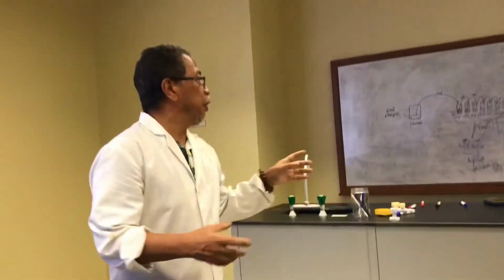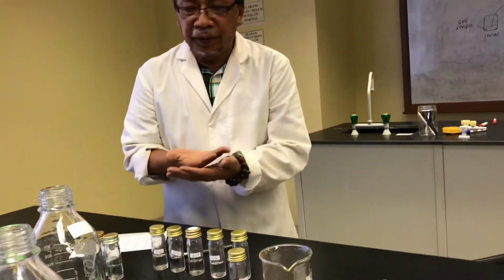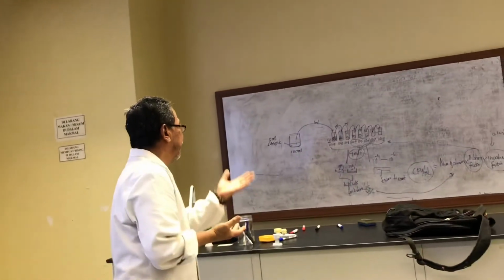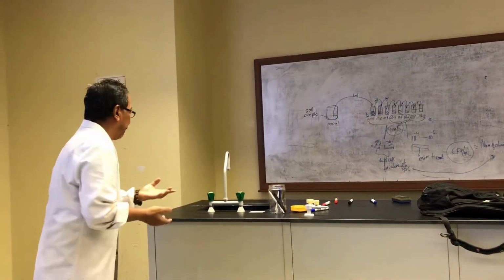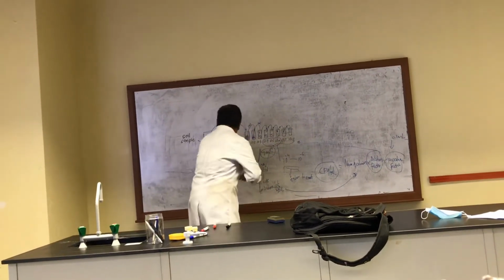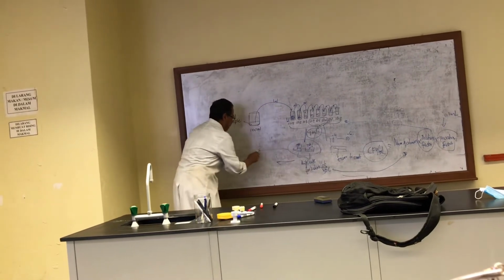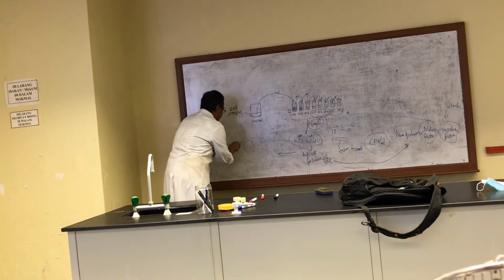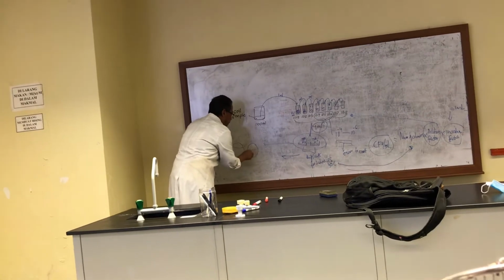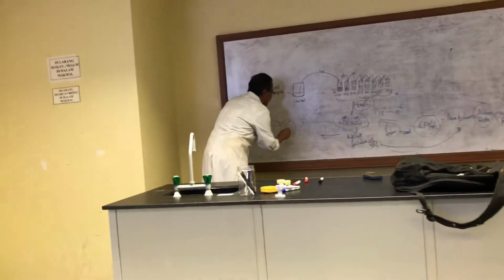Then after you incubate 24 hours, you see in your plate the colony morphology. Let's say here is your plate, so you have 2 plates there. You have a lot of colonies. This is the colony morphology.